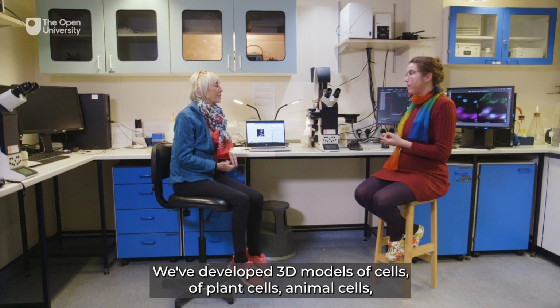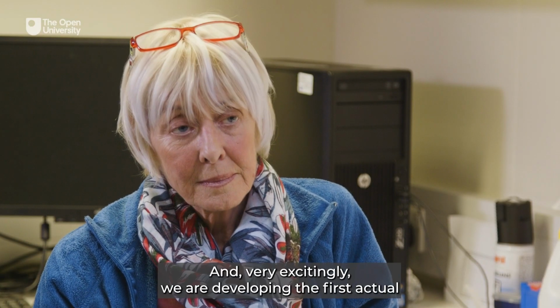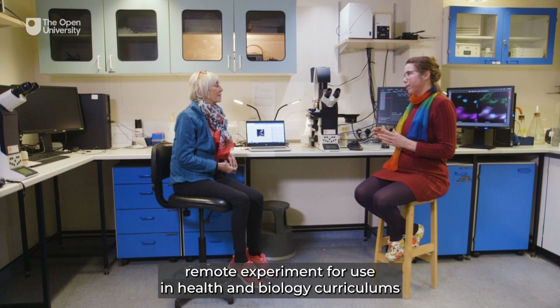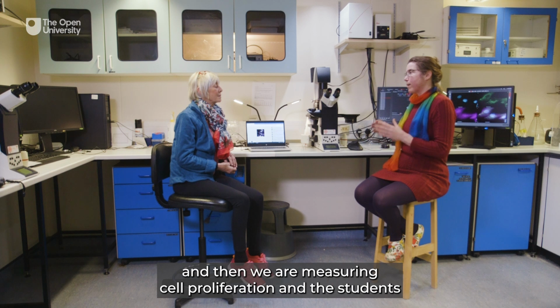We've developed 3D models of plant cells, animal cells, and bacteria that are going to be used in the new modules. And very excitingly, we are developing the first actual remote experiment for use in health and biology curriculums, where the students can decide on the treatment of a cell, and then we are measuring cell proliferation.